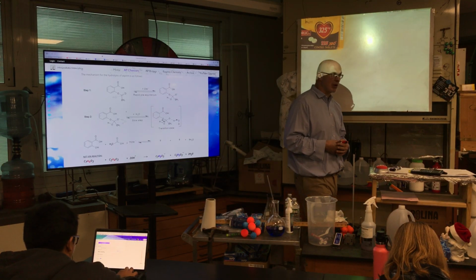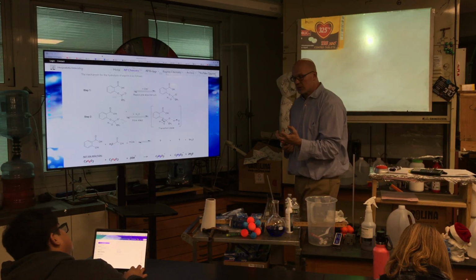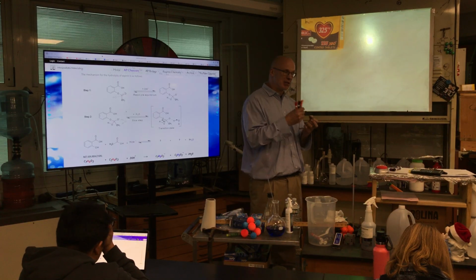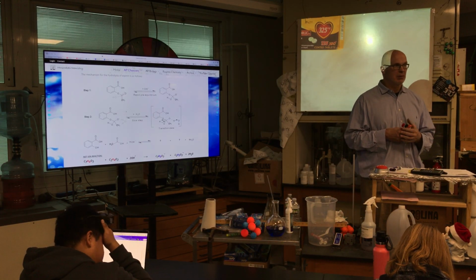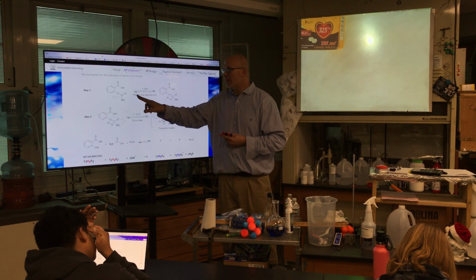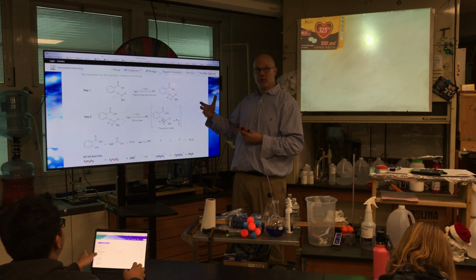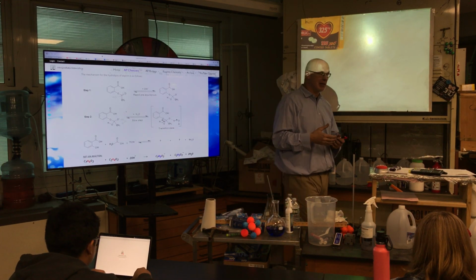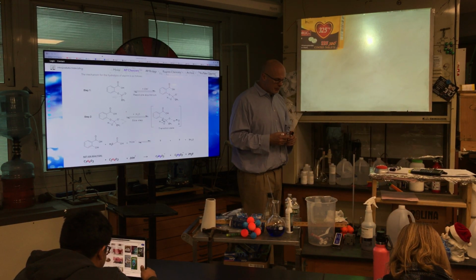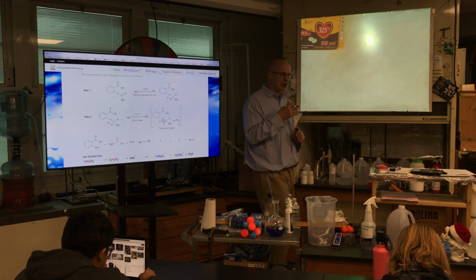The reason for back titration is that when we have a tablet that doesn't dissolve, it's really helpful to add more than what's necessary to react with it, especially when it's mixed with other components. It's hiding there. We also need to hydrolyze the acetyl group in the aspirin to make it react. All of those things lead us to do a back titration and overshoot the equivalence point. The target, of course, is 325. We'll get to that again, and go through the same calculations and a little farther today.